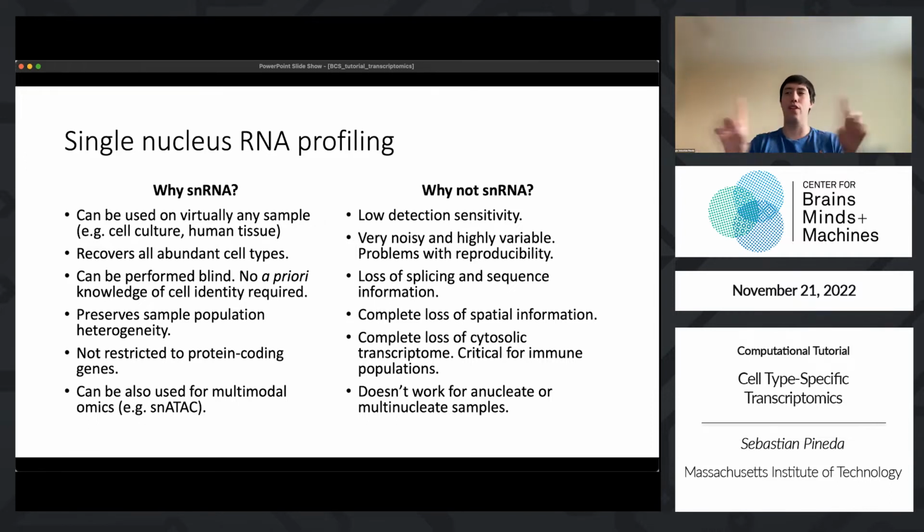You can get full length transcripts from single cell assays. They're just much lower throughput, so we can't do it at the scale that we can do it with this scheme here. There's a loss of spatial information. With TRAP, we can image things. We can see where those cells are, where they exist in the brain or within a specific brain region. We don't have that information here.